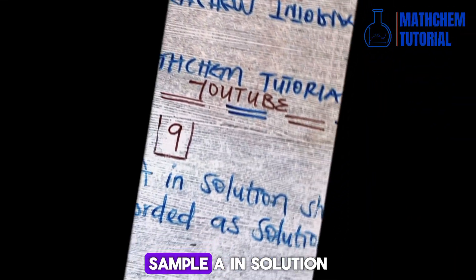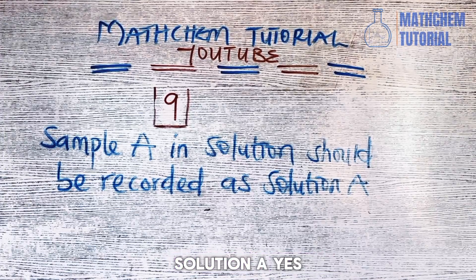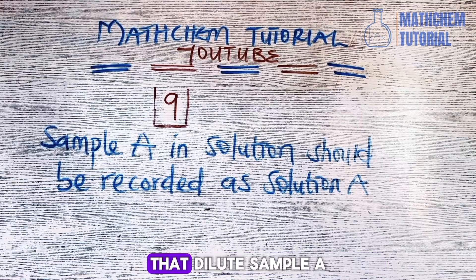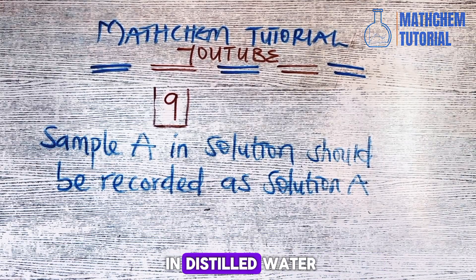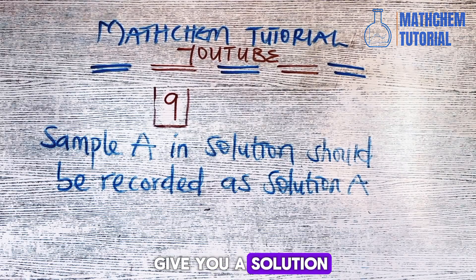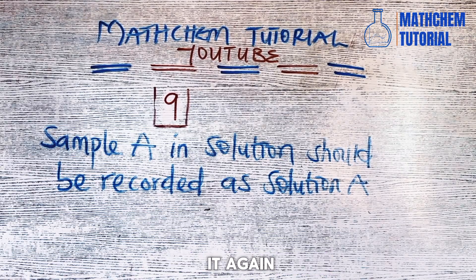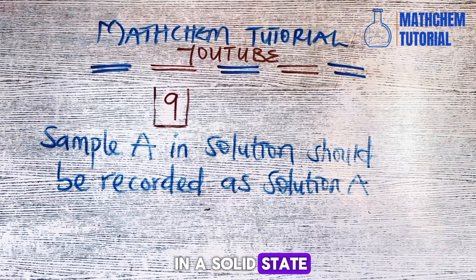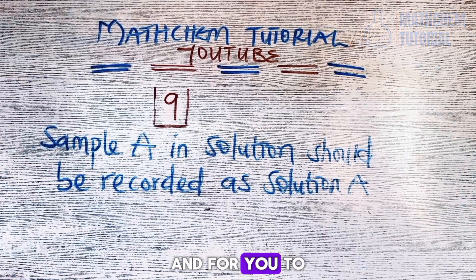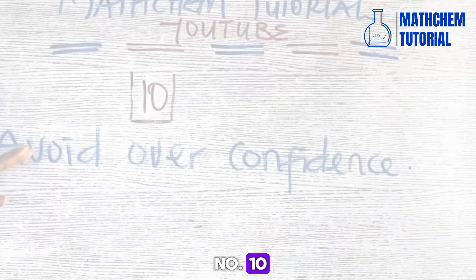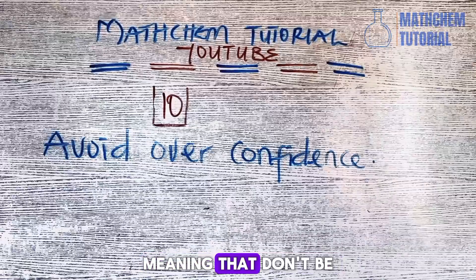Number nine: sample A in solution should be recorded as solution A. Many students make the mistake of continuing to call it 'sample A' even after dissolving it. When you are told to dissolve sample A in distilled water, it becomes solution A. Sample A is a solid, while solution A is a liquid. Once you have dissolved it in water, it forms a solution and should no longer be called sample A.